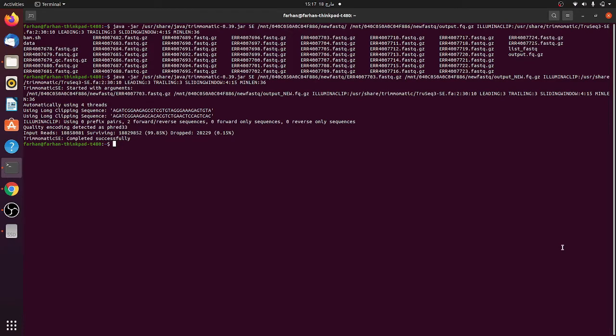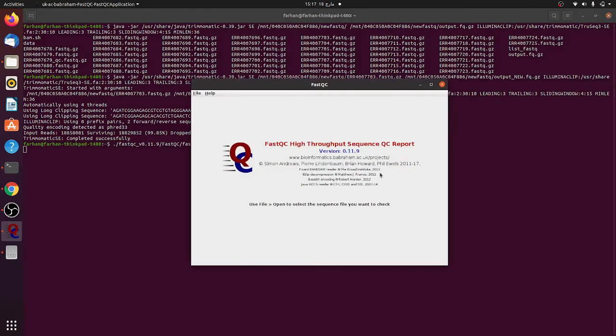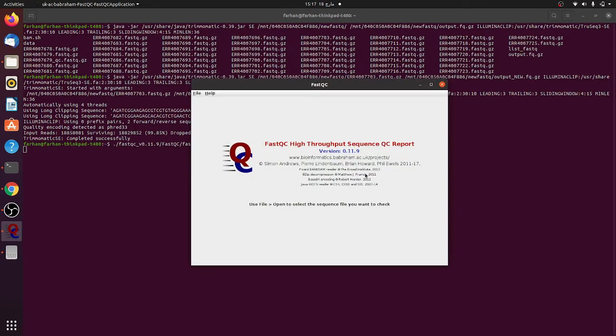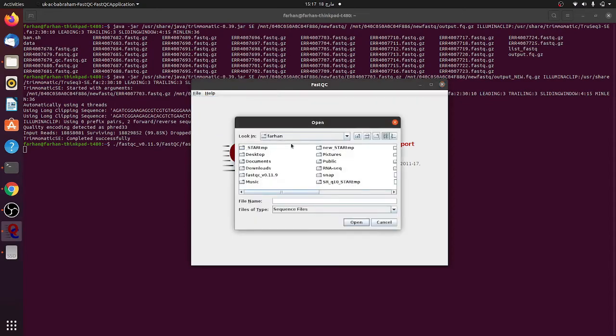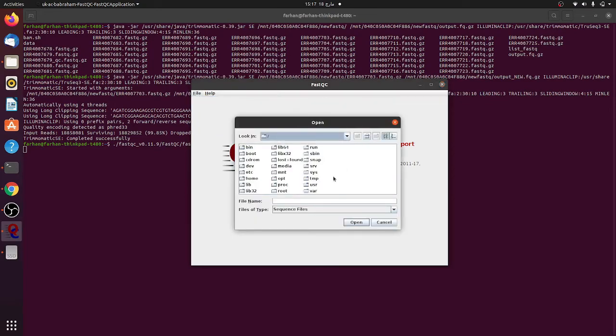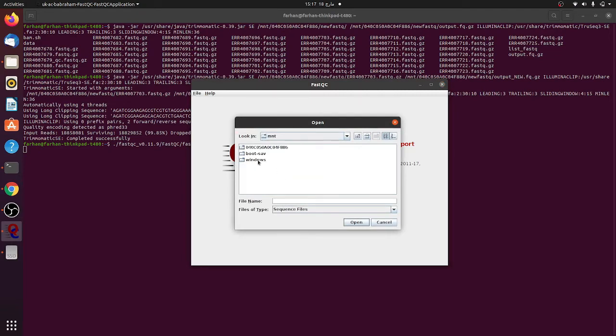If now you want to check the FASTQ, for instance, we want to run the FASTQ file. What we can do here is we can just use the graphical user interface, and here we can now go from here where the file is saved, that place we are going.